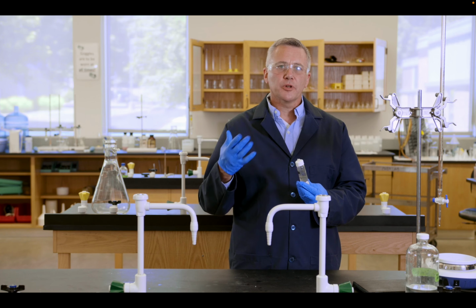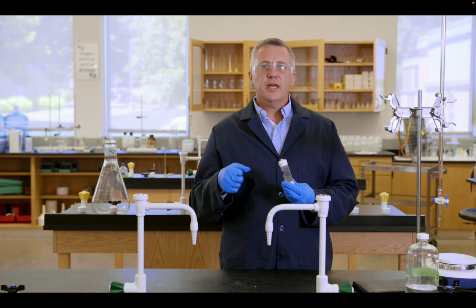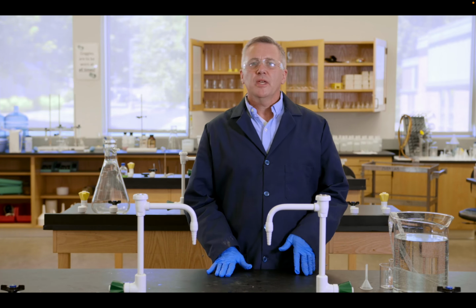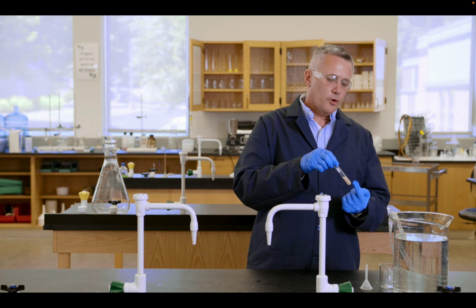Right, and so when we continue on, we're going to need that 47.8 milliliters to get further to this next step, and that'll get us up to 75%. And so for that, then we can actually have the proteins precipitated out. Okay, so we added all of our volume of SAS, precipitated out the GOT. We actually threw away the supernatant and we redissolved the pellet in 3.6 milliliters of sodium acetate buffer.